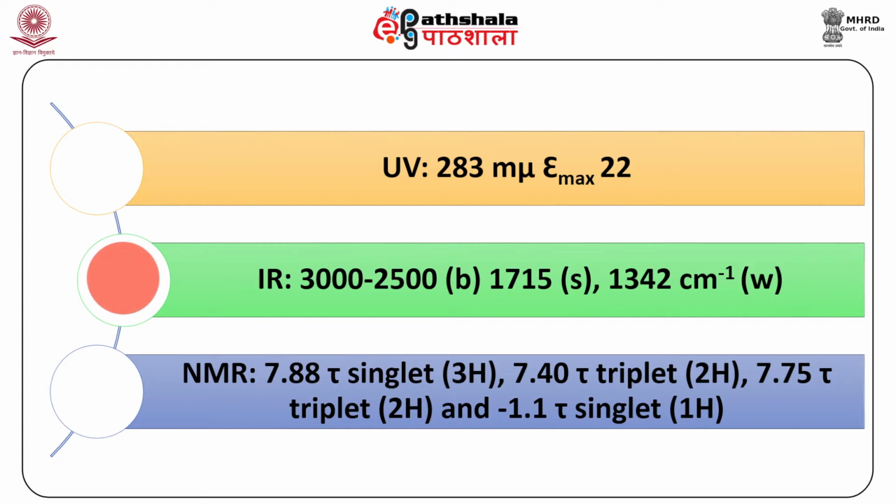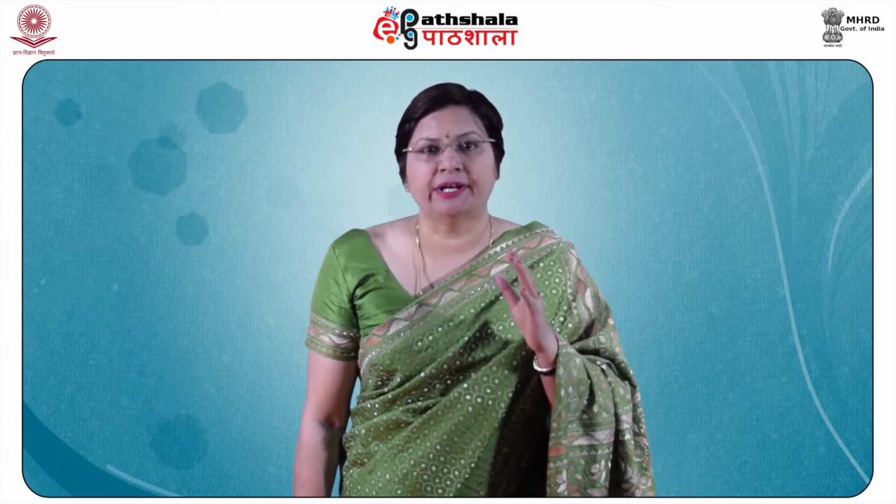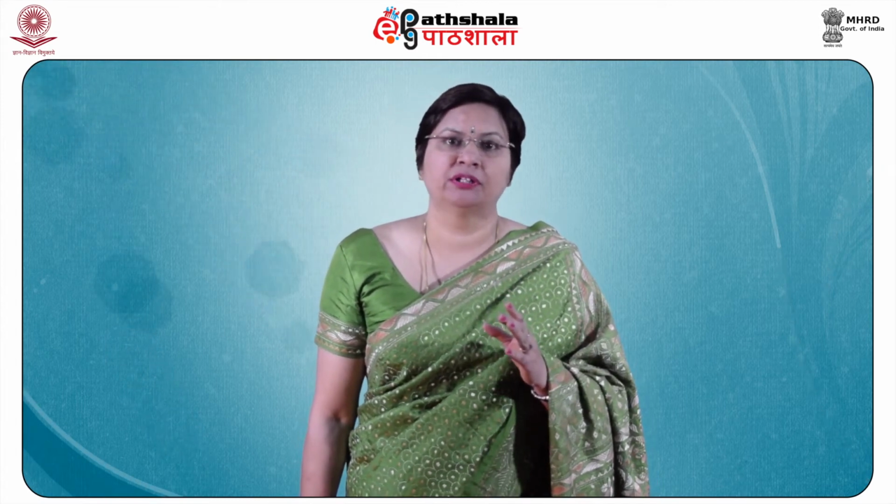In the NMR spectra, you are given peaks at 7.88, a singlet for 3 hydrogens, 7.40, a triplet for 2 hydrogens, 7.75, a triplet for 2 hydrogens, and minus 1.1, a singlet for 1 hydrogen. Based on this, the question is to find the structural formula of the compound.